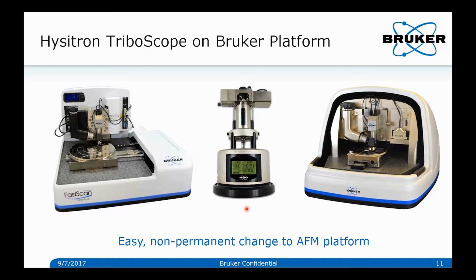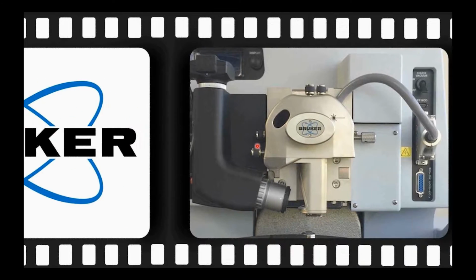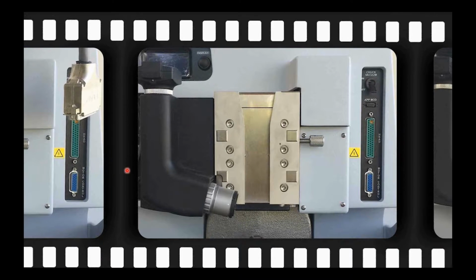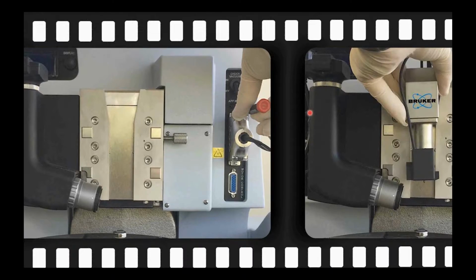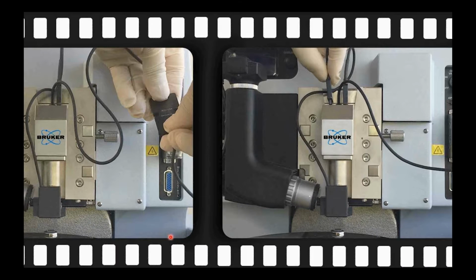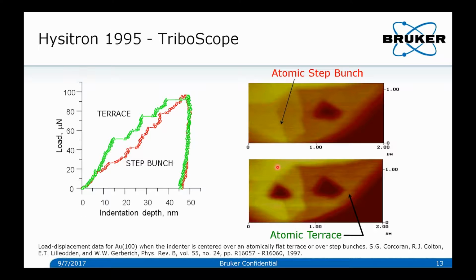The components are a little bit different depending on the system, but we do have interfaces for the different types of AFMs. So you start by removing the laser cantilever assembly of the AFM. It slides out of this dovetail slot that you see. You disconnect the cables, and then in its place you put the Hysitron TriboScope scanner and transducer, and then you make the electrical connection. You see the piezo in the silver color and then the transducer in the black at the bottom, and this replaces the laser cantilever assembly. And so it really is as simple as that as far as switching this out.